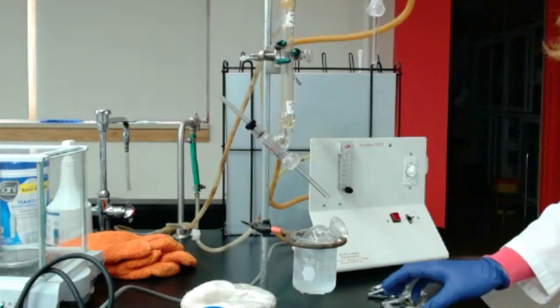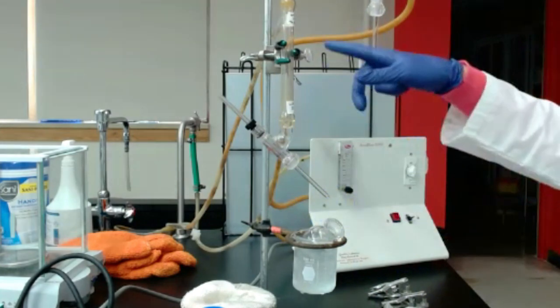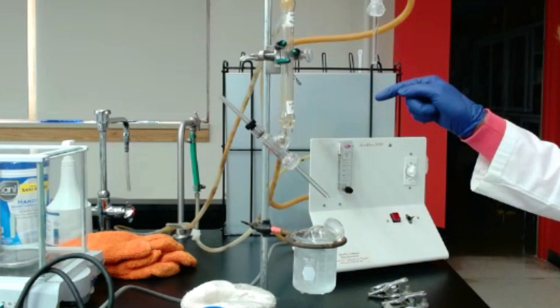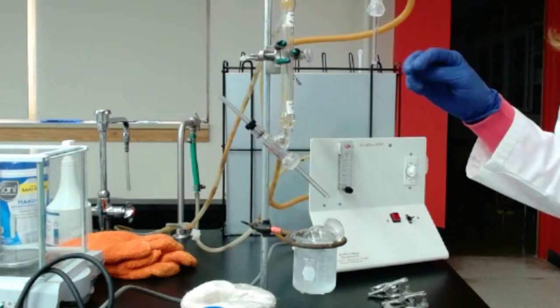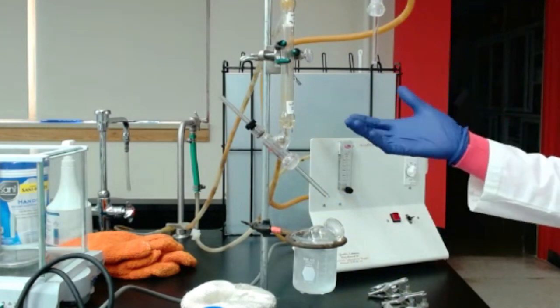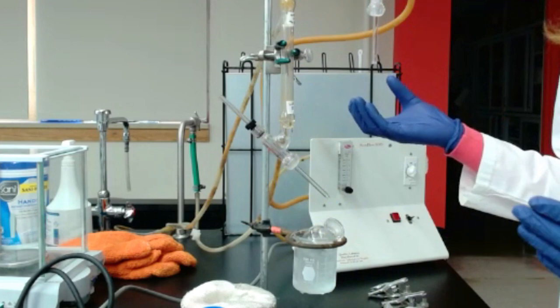And the goal is to have the molecular SO2 transported from the acidified wine to that solution of hydrogen peroxide. And that's really just to form the sulfuric acid. So the reaction is molecular SO2 plus hydrogen peroxide forms sulfuric acid. And that sulfuric acid that we obtain, we will measure using titration with sodium hydroxide.